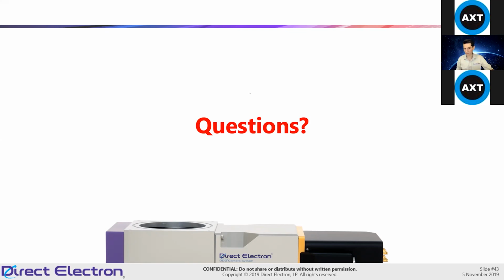So there is a question in the question answer box as well. Yeah, so I see from James: is the DE64 such a great performer by binning by 2x and turning this into a 4K system with large pixels? The answer is yes. So basically what you're doing is you're taking the 8K by 8K image, and from the sensor it is then read out as a 4K by 4K.